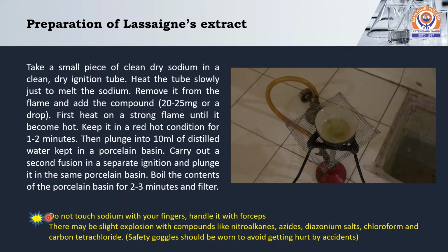In this process, we have to be careful that we should not touch the sodium metal with bare hands. We handle it with forceps, and there may be a slight explosion with compounds such as nitroalkanes, azides, diazonium salts, chloroform or carbon tetrachloride.